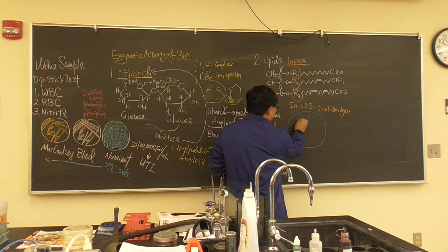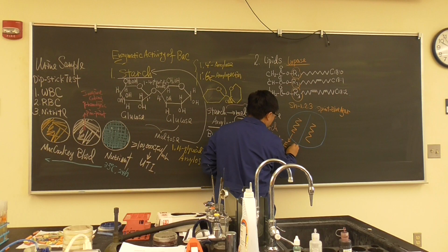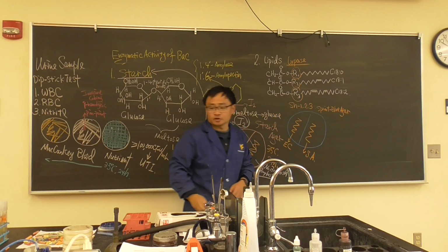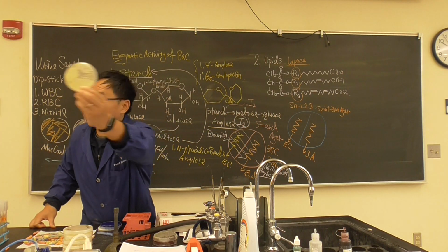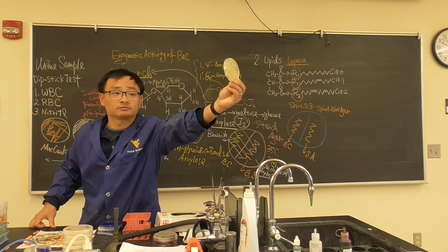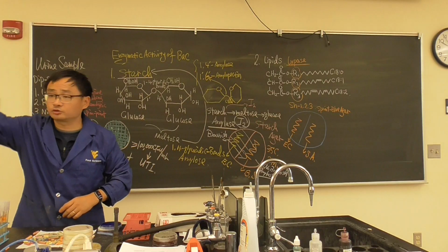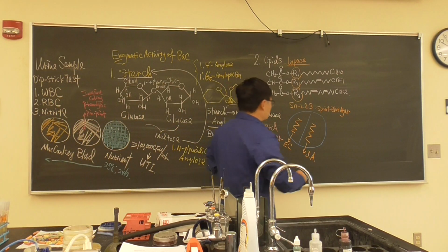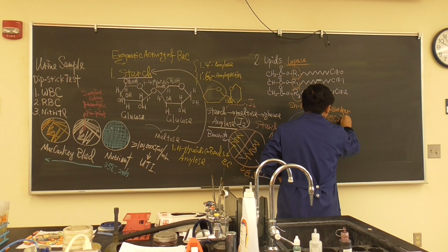On the left side, we're going to inoculate which bacteria? E. coli. Right side, Staphylococcus aureus. Staphylococcus aureus on the agar plates. This is from my lab. Okay? And the E. coli just on the slants, like we did a bit before. Then we're going to incubate at 35 degrees Celsius, 24 hours.